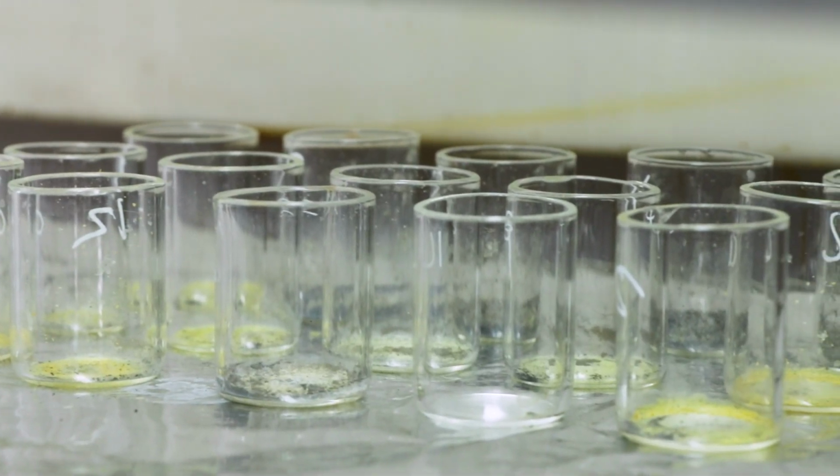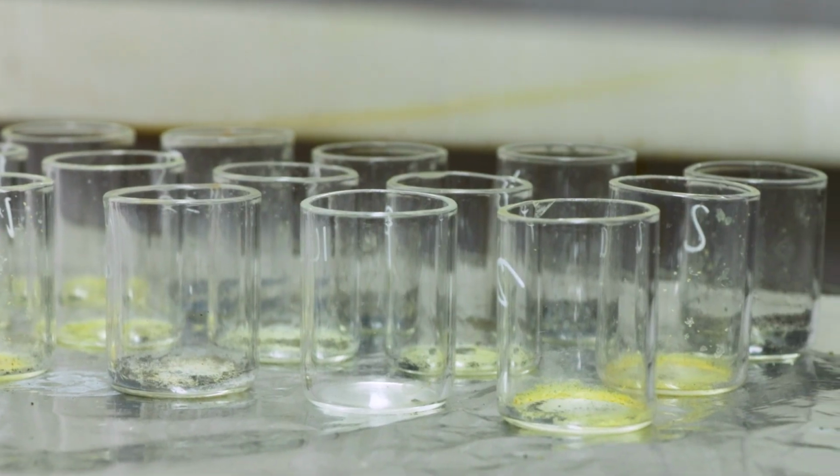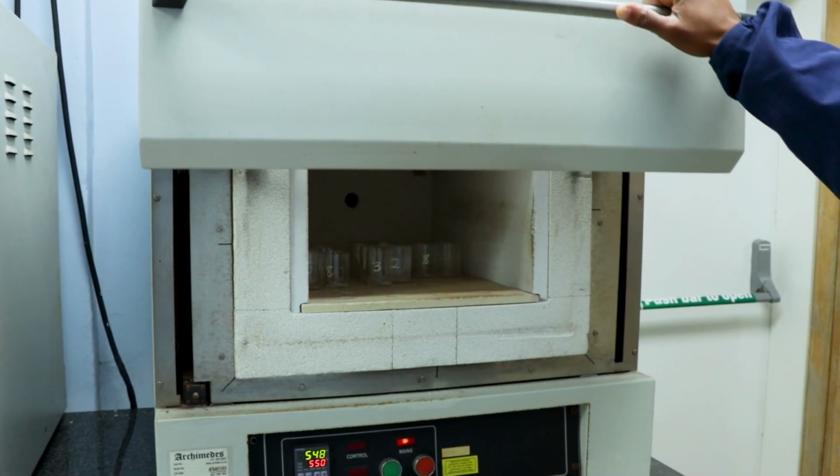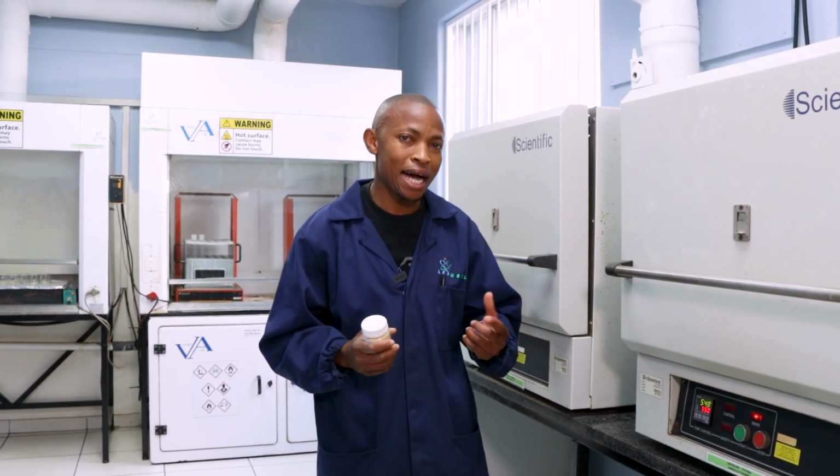For mineral determinations, what we normally do is ash your sample, then after ashing it, you digest it with acids. Also, some of the minerals that we analyze, you want to digest with the microwave. Then after that, you put your acids, then you run on the instrument, which is the ICP.